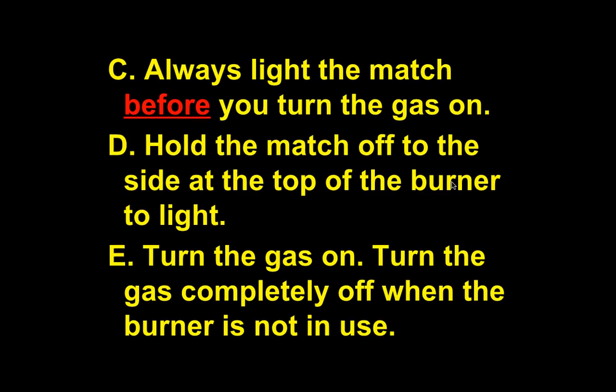Always light the match before you turn the gas on. The reason is that sometimes people can't light matches, so they'll turn the gas on and keep trying to light the match. If it takes 10, 15, 20 seconds, all that gas is going into the air. Usually I smell it and turn off all the gas because I don't want an explosion. So make sure you light the match first.